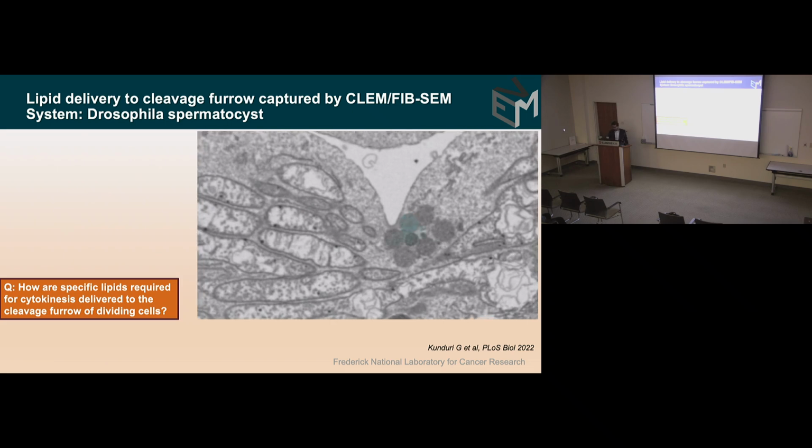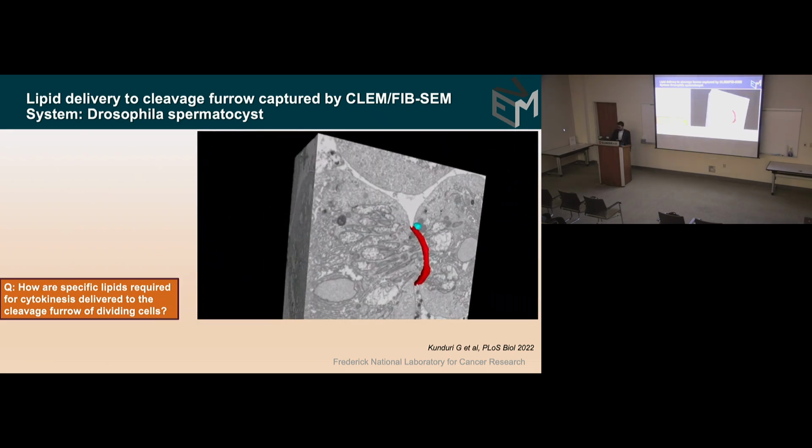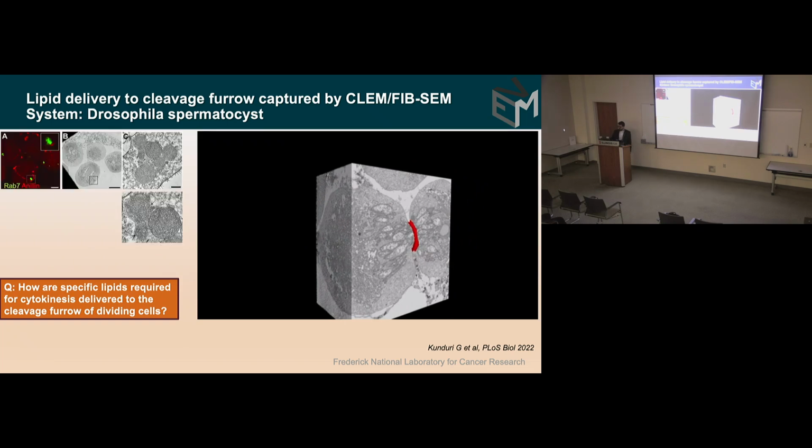And so what this allowed us to do, by the way, we followed this up with some TEM to show that each of these lipid compartments are in turn made up of very small granules of lipids, essentially allowing us to clarify this mechanism where lipids are endocytosed into these early endosomes.